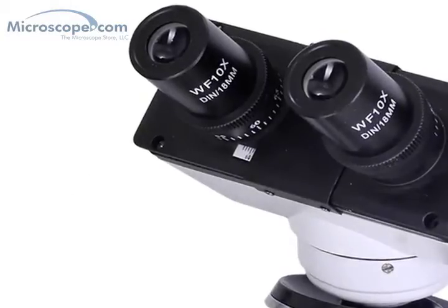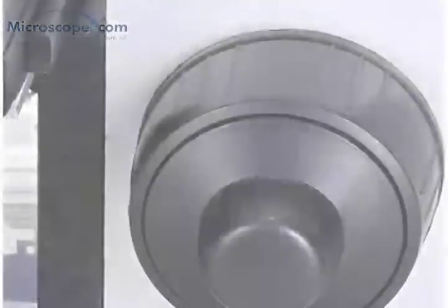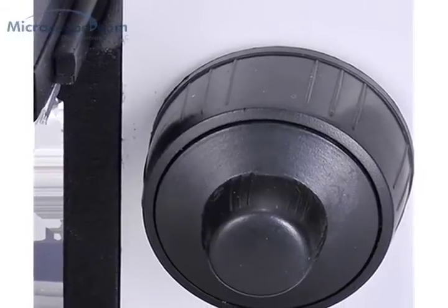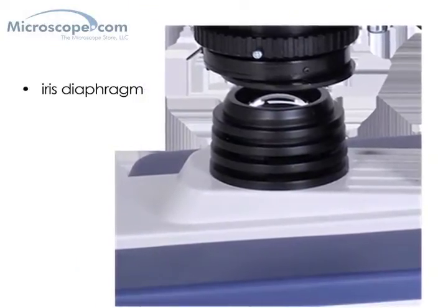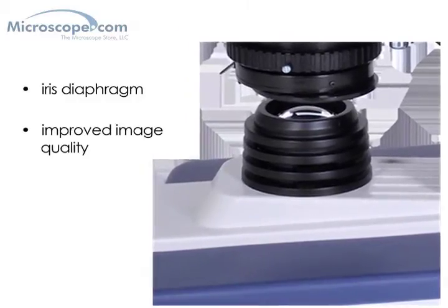Each microscope in the 118 range features wide-field 10X eyepieces, a high quality rack and pinion focus system with safety stop, and a slip clutch to prevent accidental damage. Every model also features a quality condenser under the stage with an iris diaphragm, giving you professional style control over the light focus on your subject. This improves the quality of the images that you see through the microscope dramatically.